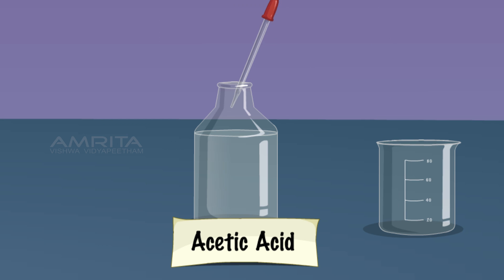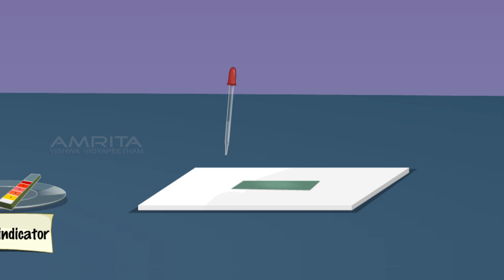Take a small quantity of acetic acid using a dropper. Pour one drop of acetic acid on the pH paper.